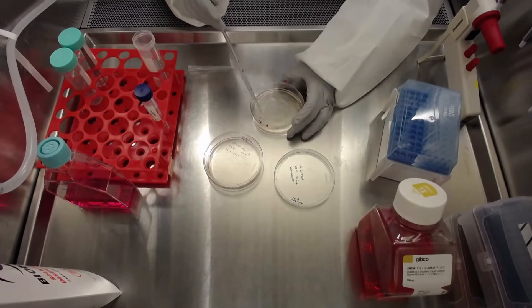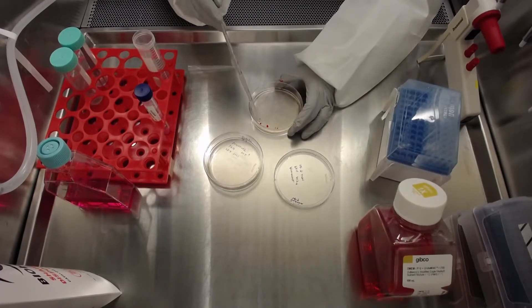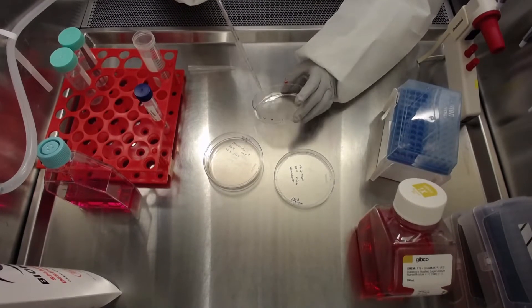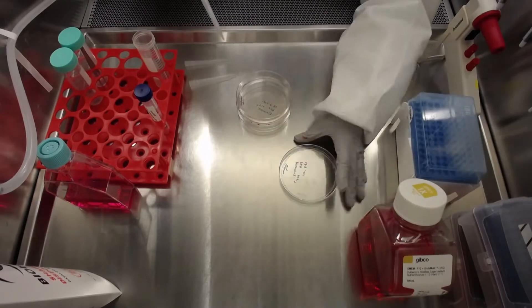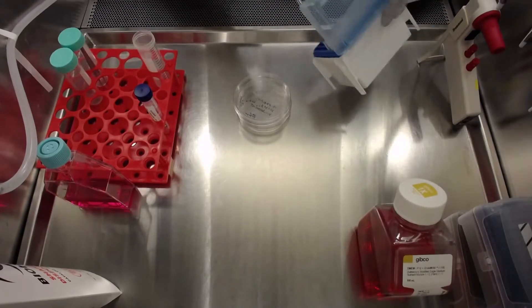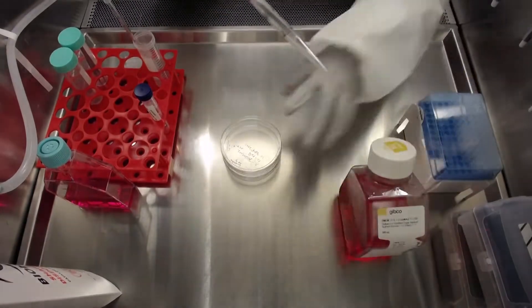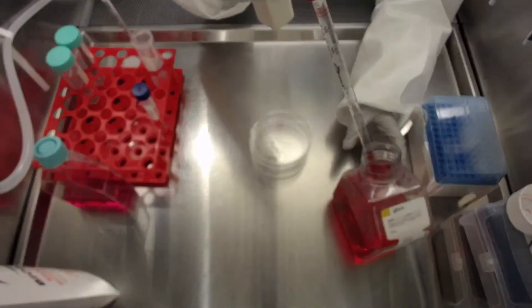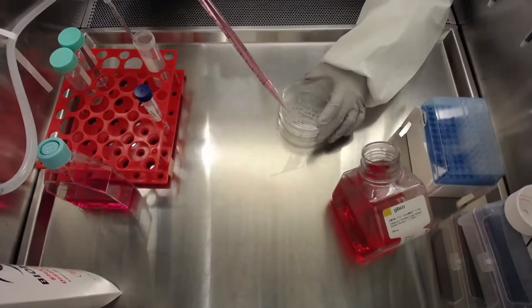We start with two 10 centimeter dishes of human iPSCs at 80% confluency. There should not be any spontaneously differentiated cells in the culture. In case there are some differentiated regions, follow the steps of our removing spontaneous differentiation video to remove them before proceeding to the next step.